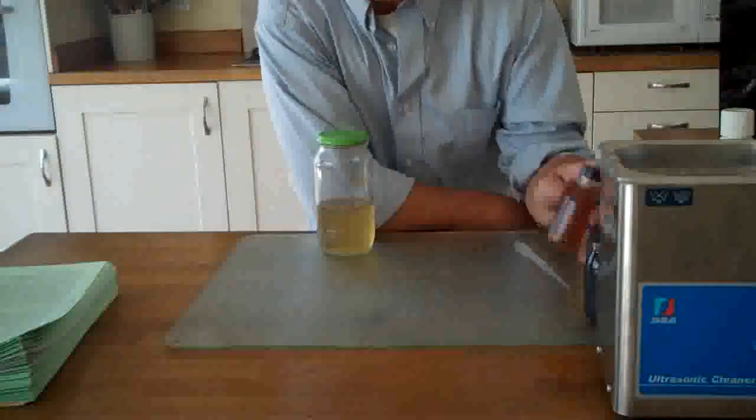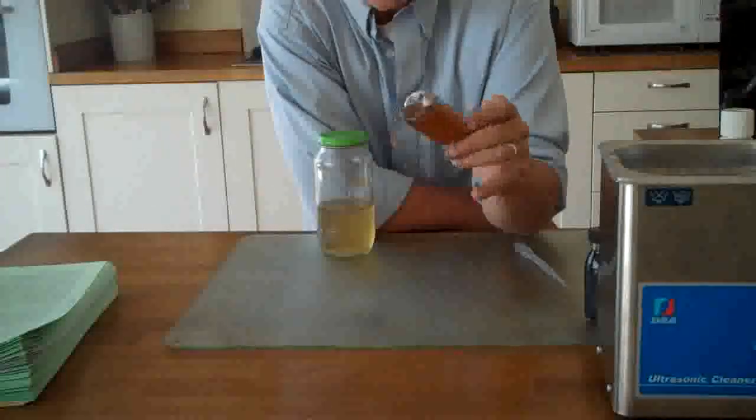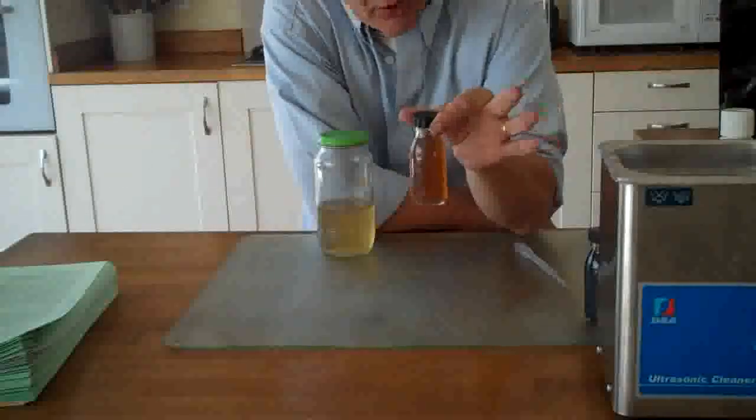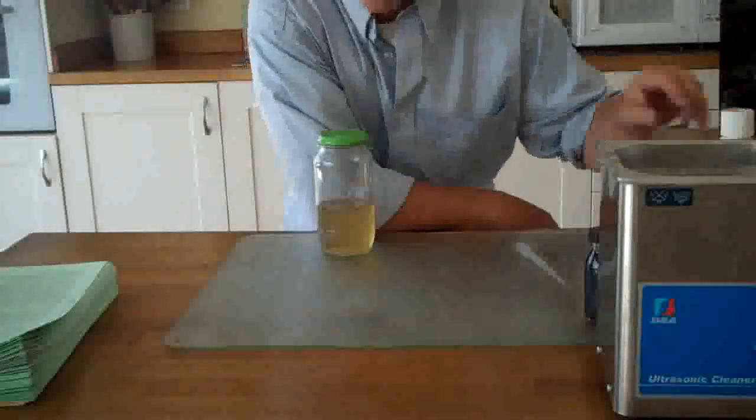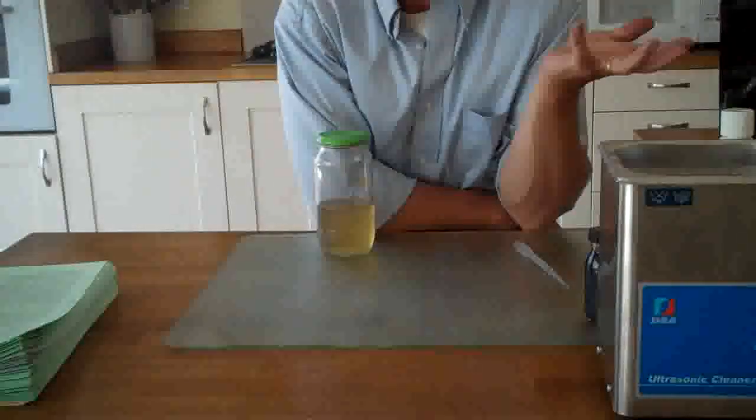What we did from previous experiments was produce this stuff, which is the graphene oxide in solution. There's about 60 millilitres of it there and it's this nice golden brown colour. Now what we're going to do now with it is — because what we need really is quite a lot of graphene as opposed to graphene oxide.